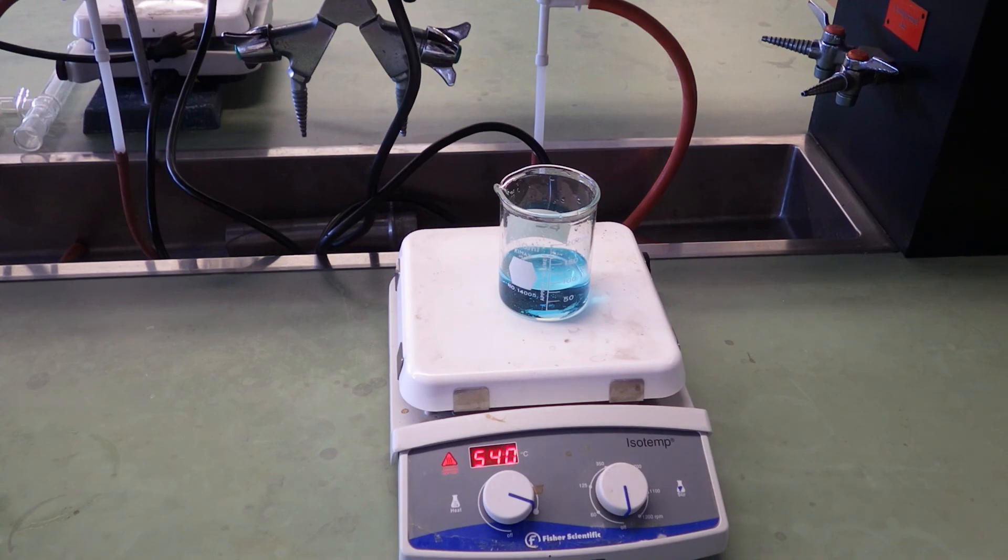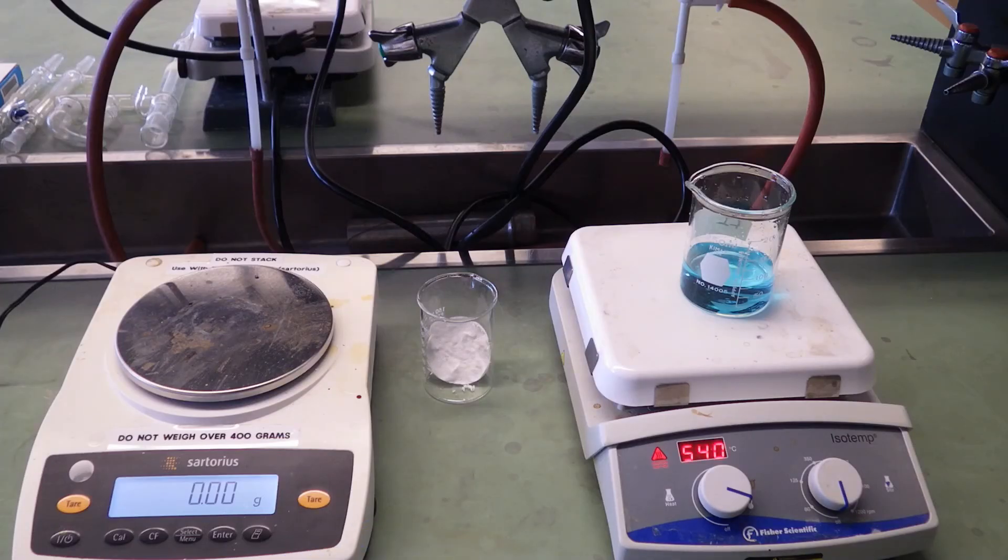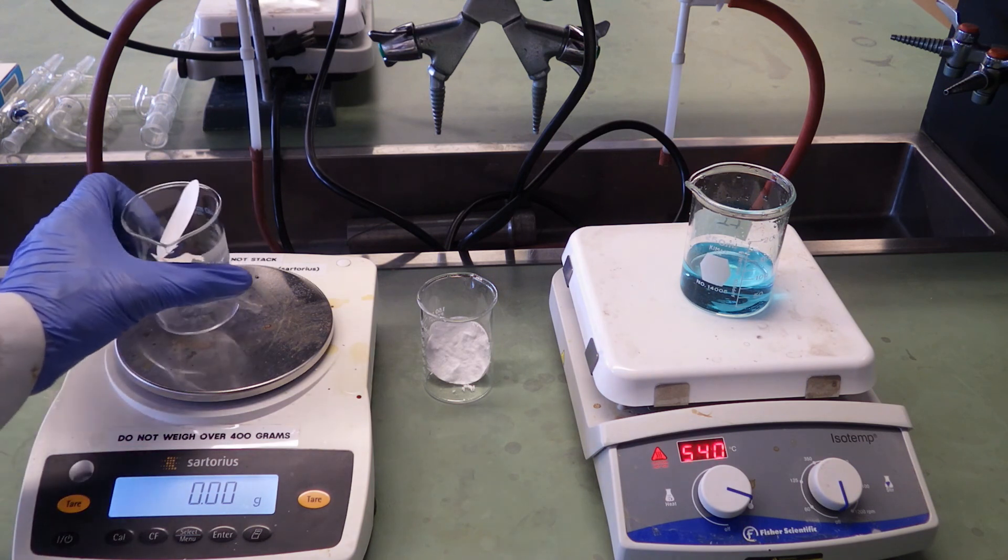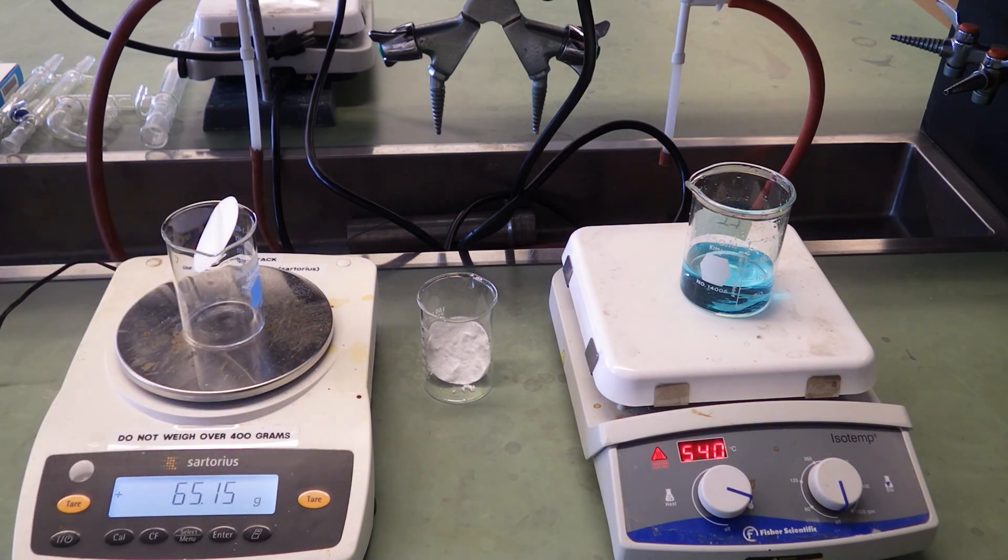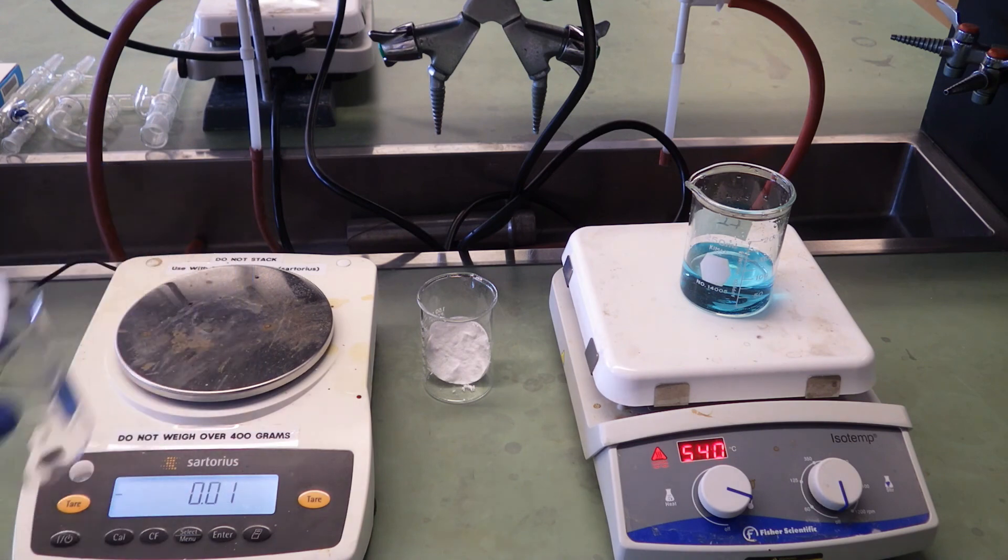We'll crank that temperature up pretty high so we don't have to wait too long. While we're waiting, we might as well weigh another beaker and filter paper for the CSP salt that we're going to collect later. Record that mass: 65.15 grams beaker plus filter paper.